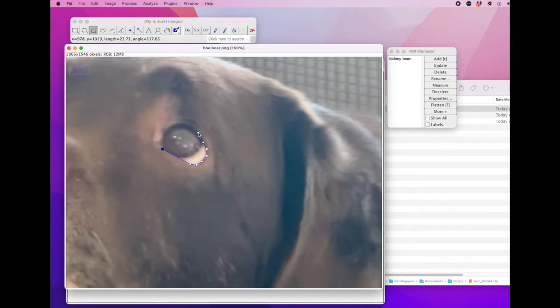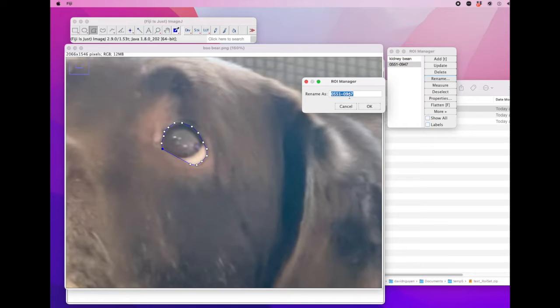So if I just click, if I do small segments, right, I can approximate the shape of this line. And to close it, I double click on the square from which I started, like this one. I double click, there you go, and I press T, and now it adds this outline as a new ROI object. I will rename it and call it, all right, let's see, Polygon.